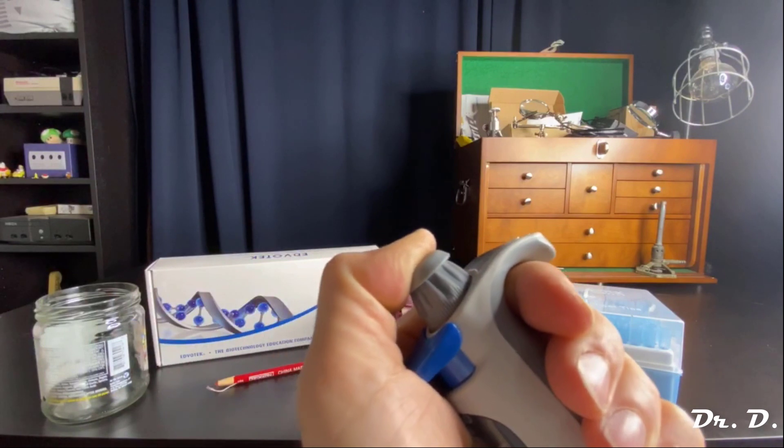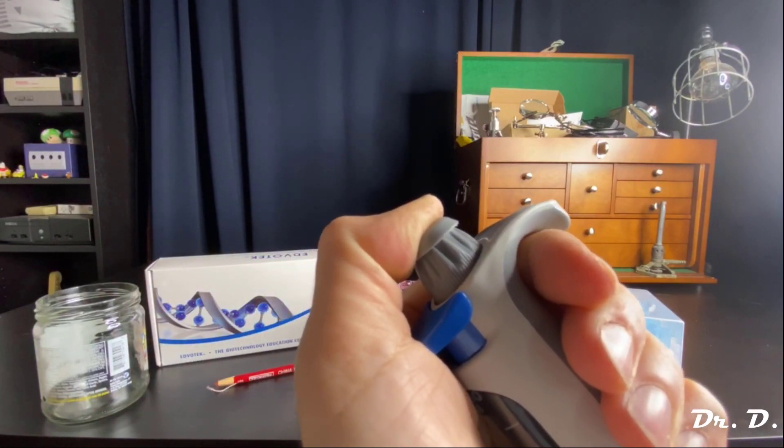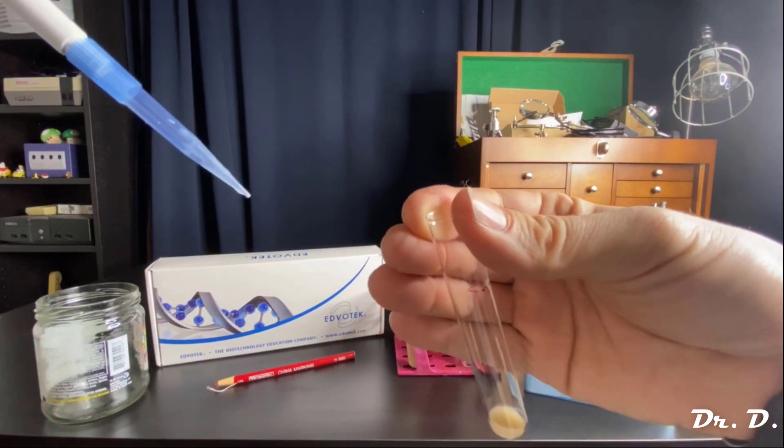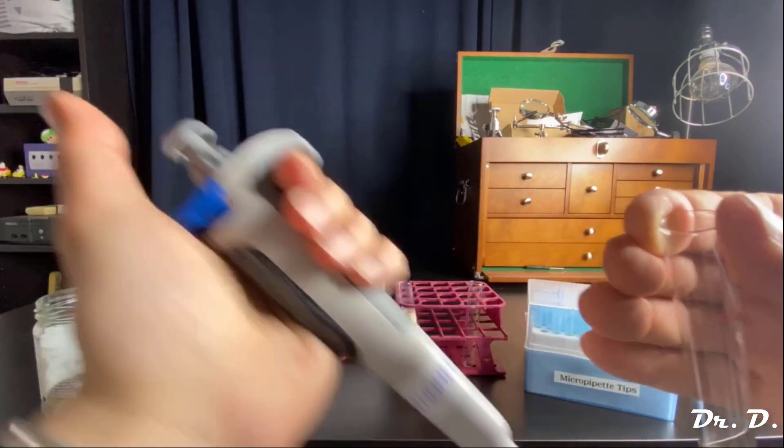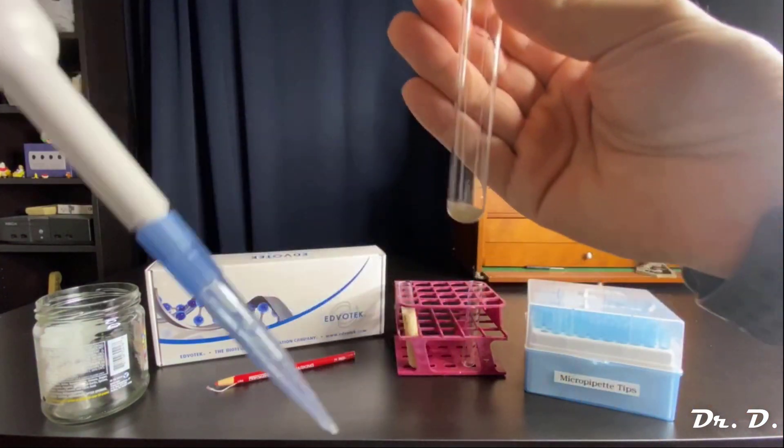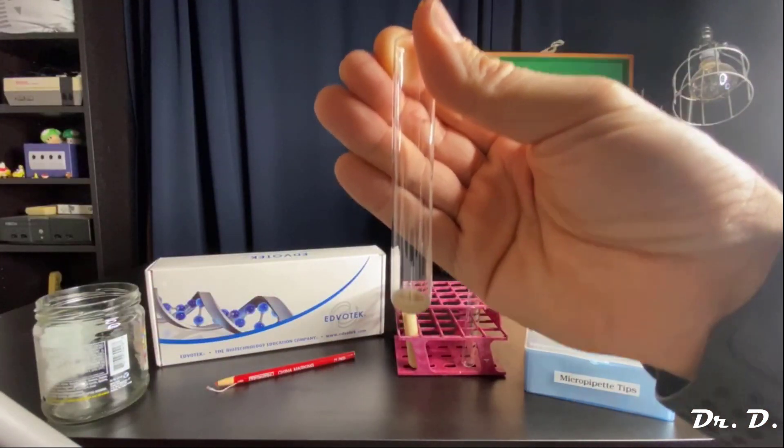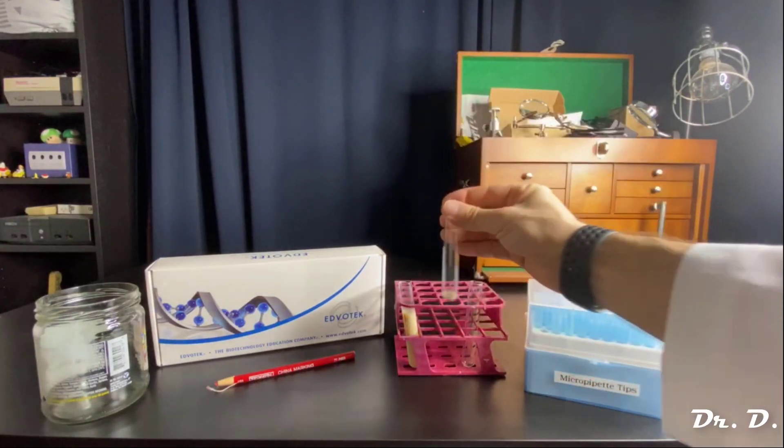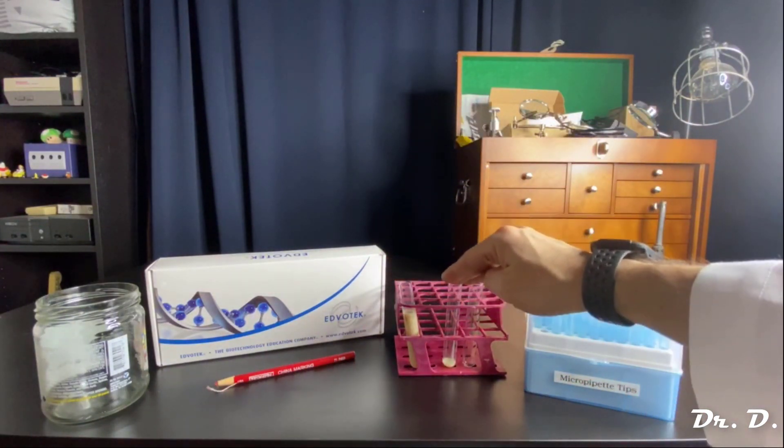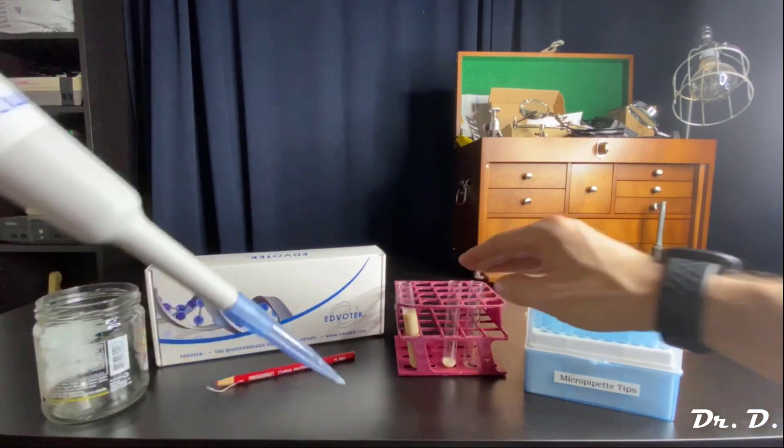And without letting go of my thumb, I remove the tip from the tube. Then I remove my thumb. And then there should be no solution left in my tip. And 500 microliters has been aliquoted into tube two. So there you go. I've aliquoted 500 microliters of solution from tube one to tube two.